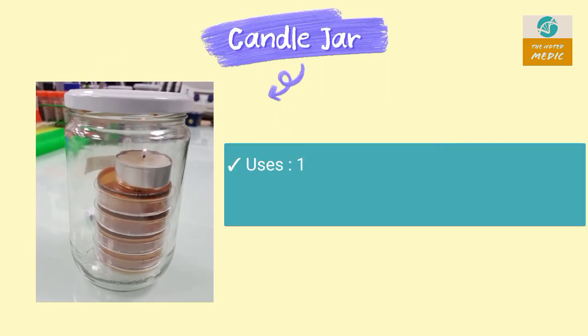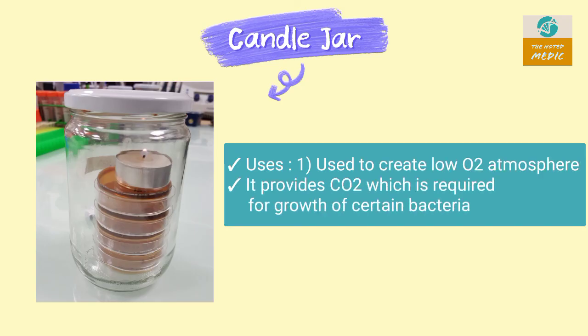This is a candle jar. It is used to create a low oxygen atmosphere. It also provides carbon dioxide, which is required for the growth of certain bacteria.